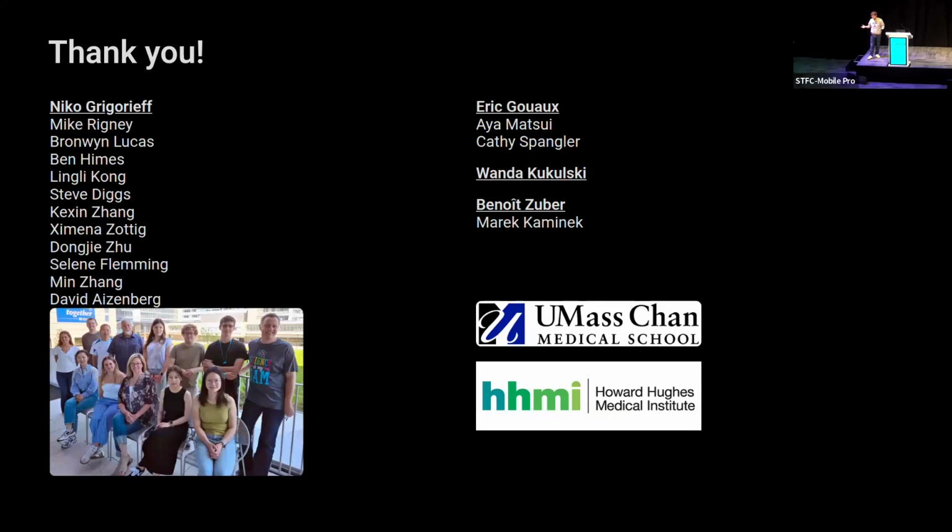So yes, the sample support is another great question, right? Right now there are these holes, and we can only see in these holes. So we want larger holes and fewer grid bars to really minimize the amount of sample that we can no longer image. We will probably never be perfect, but we can try to be as good as possible.